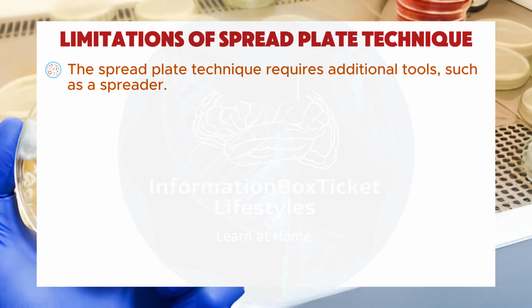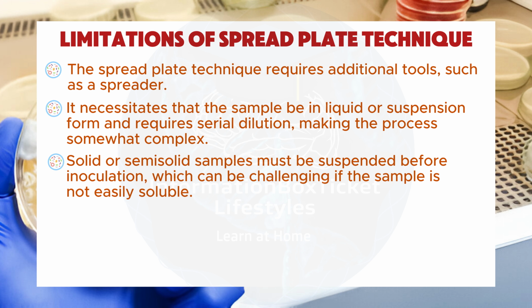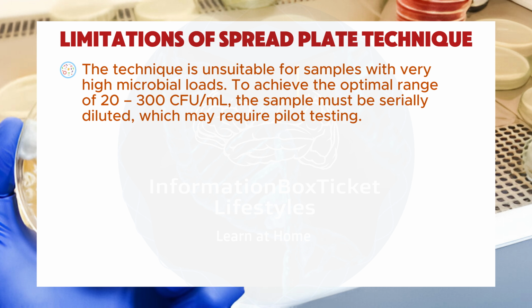Limitations of spread plate technique. The spread plate technique requires additional tools, such as a spreader. It necessitates that the sample be in liquid or suspension form and requires serial dilution, making the process somewhat complex. Solid or semi-solid samples must be suspended before inoculation, which can be challenging if the sample is not easily soluble. It is not effective for the growth of microaerophiles and anaerobes. The technique is unsuitable for samples with very high microbial loads.